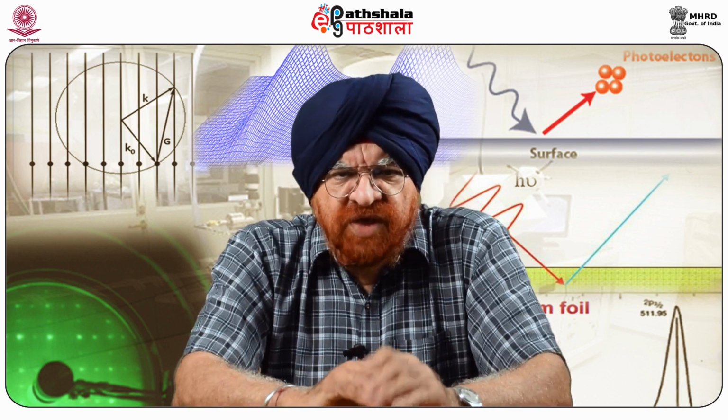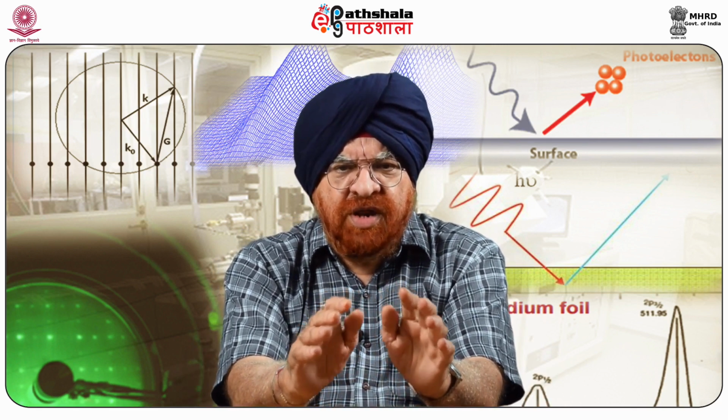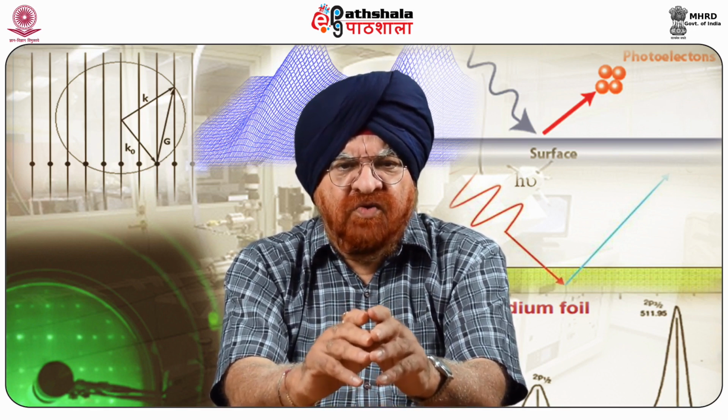In the introduction, we will read that it is a variation of atomic force microscopy, which has become a versatile tool for characterization of material surfaces. With AFM, the structure morphology is probed using simple tapping or contact modes that utilize van der Waals interactions between the tip and the sample to maintain a constant probe deflection amplitude. That's called the constant force mode, or one maintains height while measuring the tip deflection, that is the constant height mode.